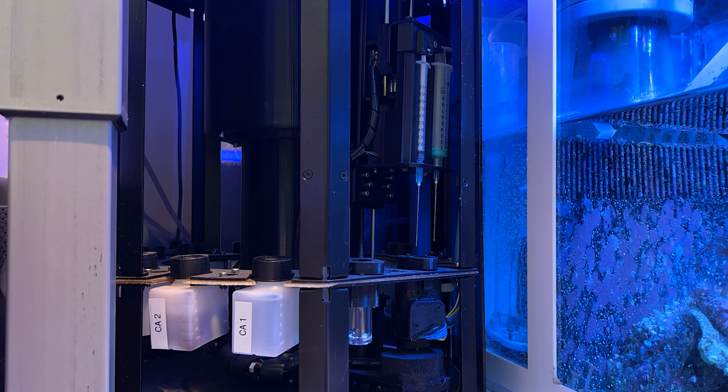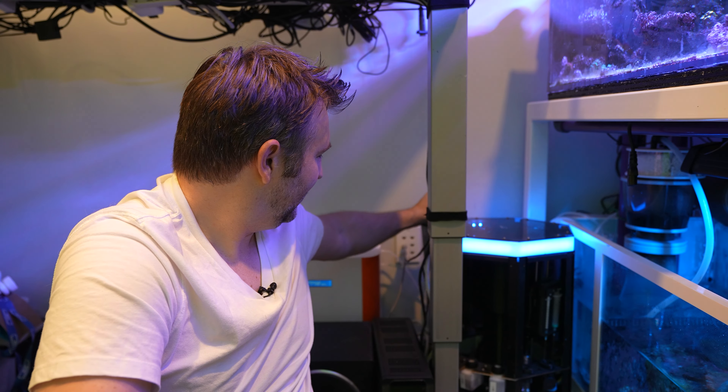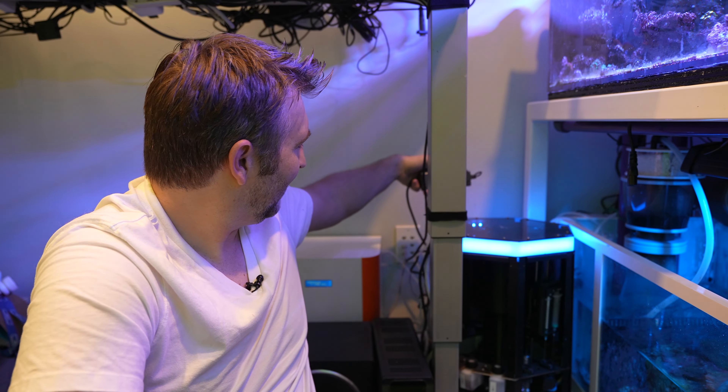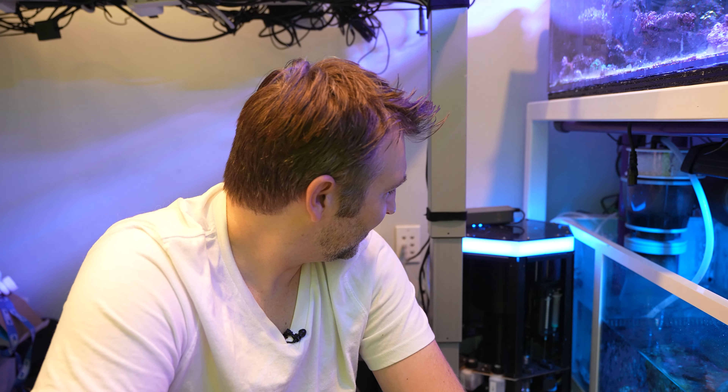Overall it's been solid. I'm really happy to report I've had no big issues with it — testing reliably weekly for just shy of a year. My only real complaint with the design is the power cord lead off the back is extremely short. I really wish they had a longer cord. It doesn't sit on the ground; if you mount it on the wall, not a big deal, but a barrel plug extension cord would fix it easily.